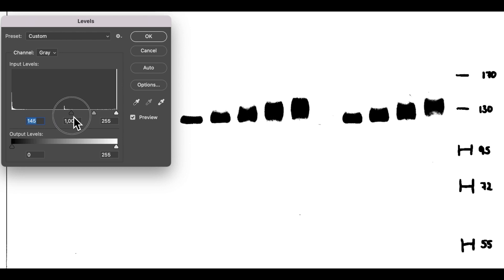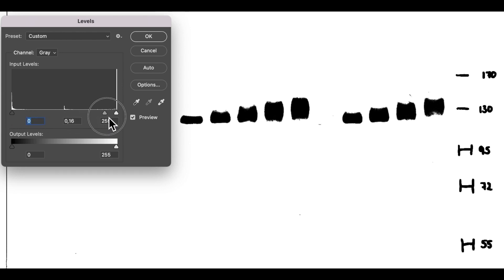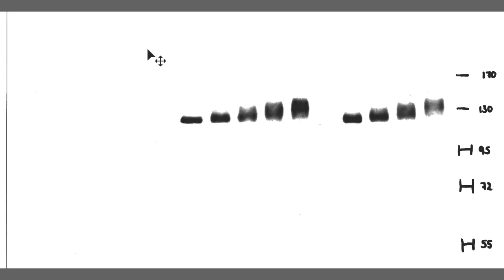We can darken the image, but we cannot make the signal reappear. Over-contrasted blots should raise a flag, and original images with visible background noise should be requested.